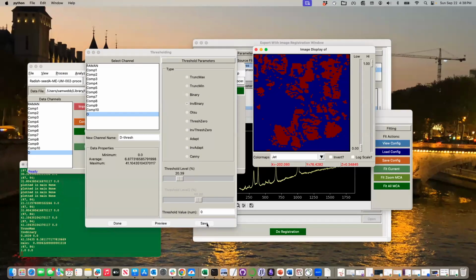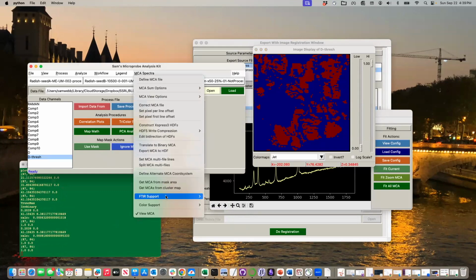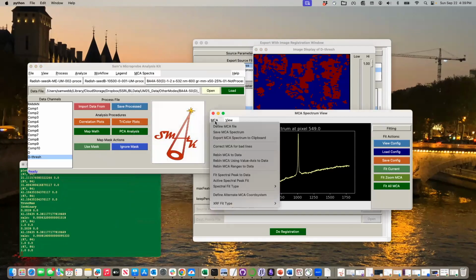We're going to save that channel. And now we'll see if this still works because it's been a while. I'm going to be on the D threshold channel under MCA spectra. I hope it's in, nope, it's not in there. Oh, it's in here, I think. Yeah. Let's see if it's in here. Yeah, here we go. Okay.